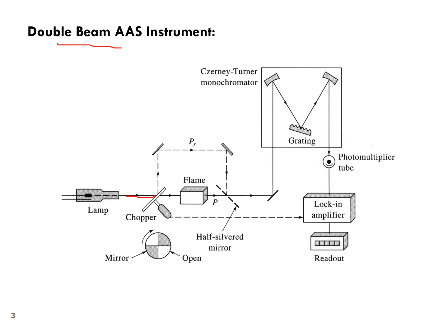Satu akan go through the flame, or kita panggil as sample beam, dan satu lagi akan go around the flame, or kita akan panggil dia as reference beam.